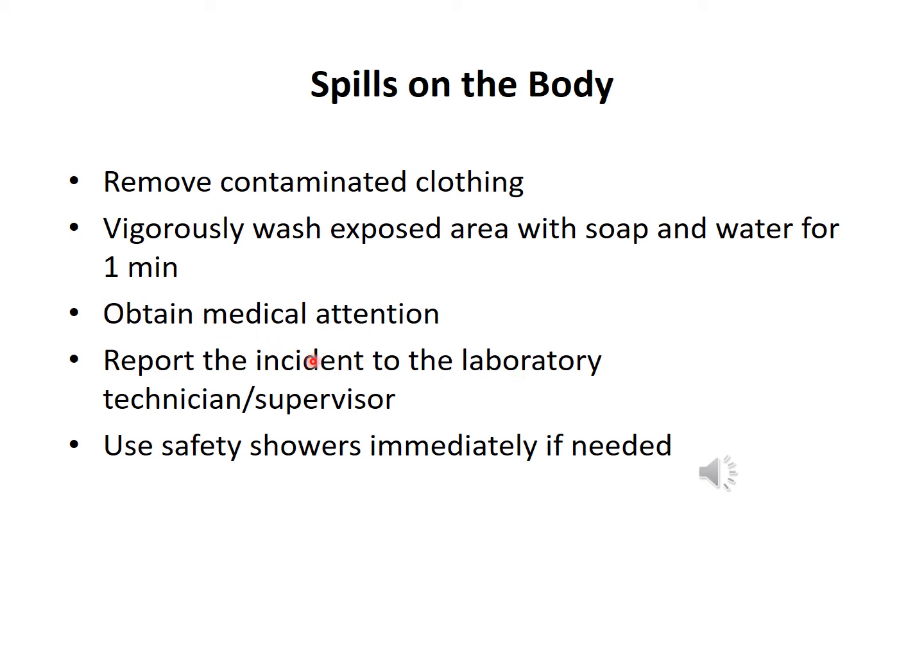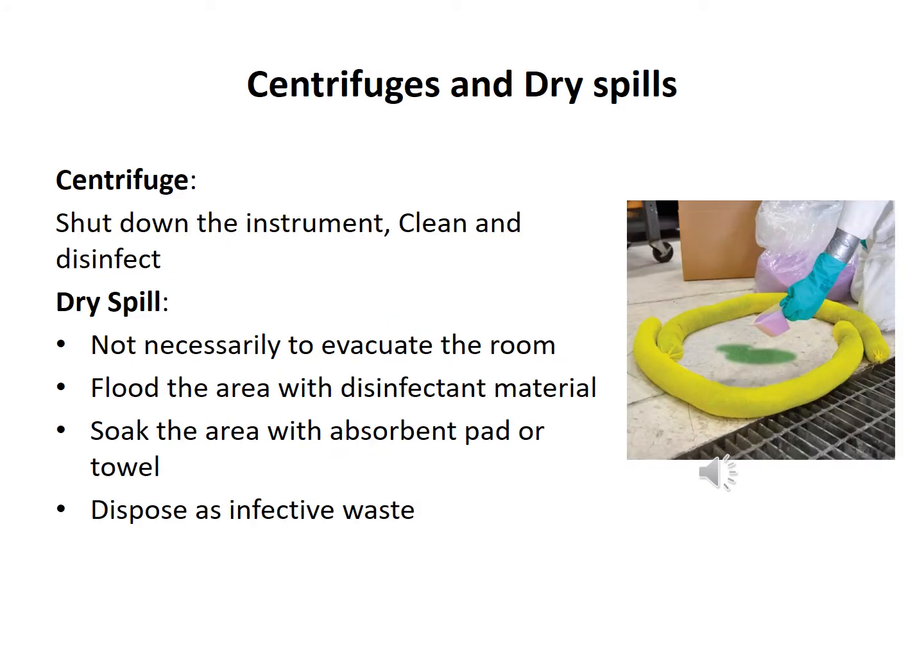And immediately obtain medical attention and report the incident to the laboratory technicians, and of course use safety showers immediately if needed. Especially if the spillage happens on sensitive parts, for example your eyes, then those are more dangerous. So I think we will talk more about the eyes in the coming slides.